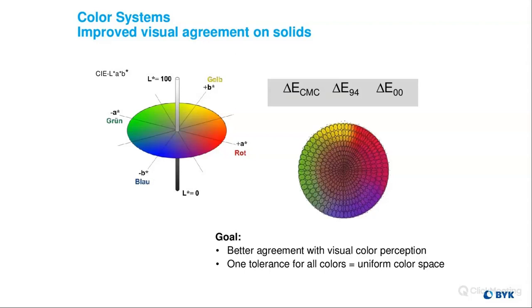Things aren't consistent. I'll get a call from one plant and another plant, and they're saying, we're measuring the same thing, but we're each getting different values. And so the first question I ask is, what equation are you using? What light source? Different things that could affect your reading.